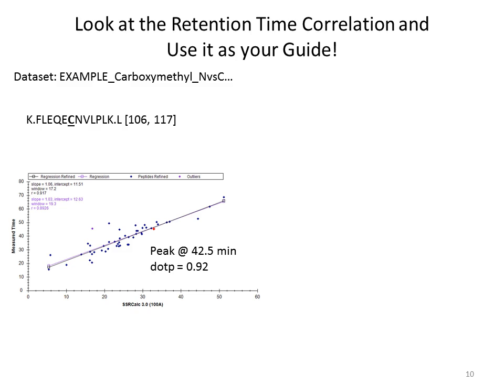So making sure that you have a good regression matters, and in my experience, most peptides adhere pretty decently to this regression. But there are ways, called indexed retention time, where you can make it a little bit more refined. But the point being here, if you right click in the retention time plot and you look at linear regression, each one of these dots represents a peptide, and the one that's red is the one that you have selected.